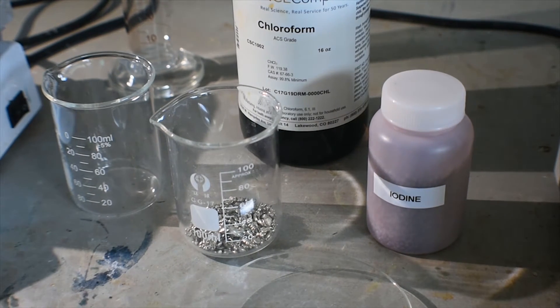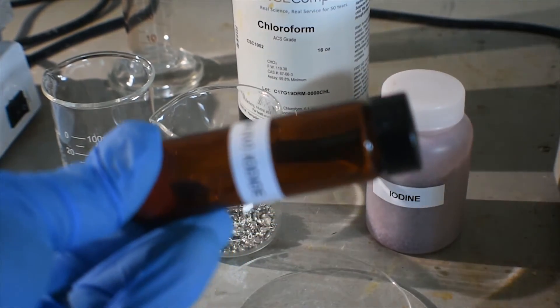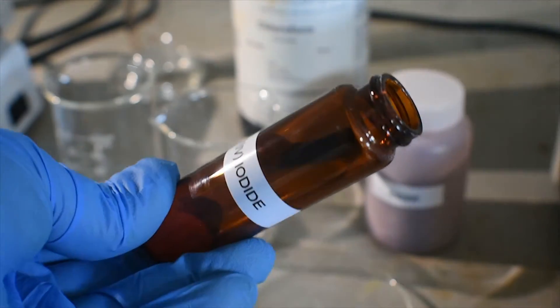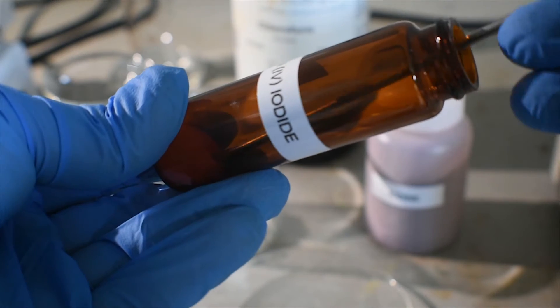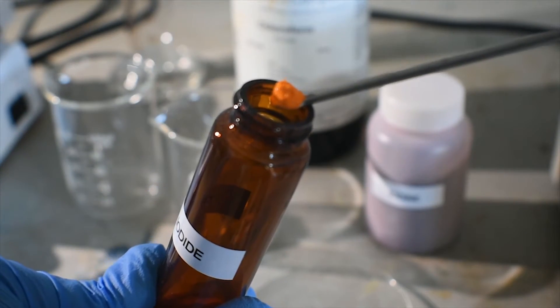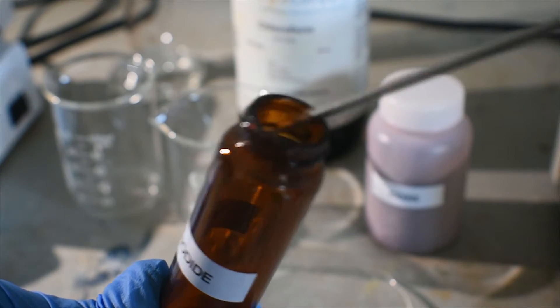I actually have a little bit of tin iodide here that you can see, just in this amber glass vial. It's a very nice bright orange powder. You can see it there, and that's exactly what we've been making today.